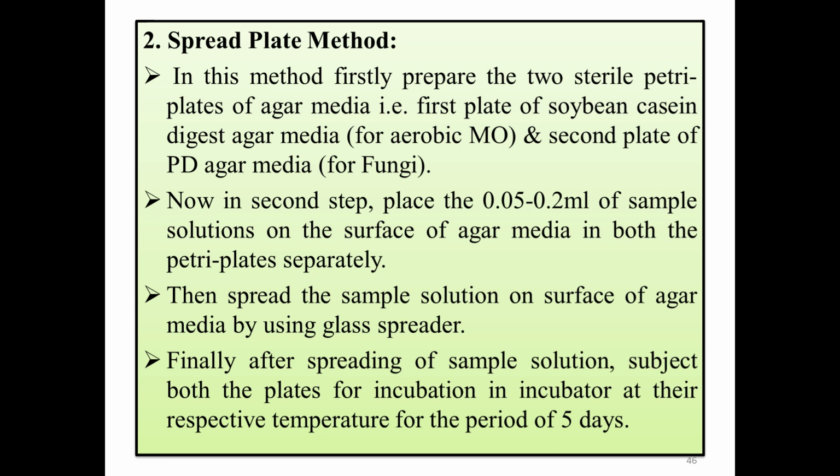With the help of a glass spreader, or anything like a glass slide, which can also be used to spread the sample on the agar media. So we'll use the glass spreader to spread the sample on the surface of the media. Then finally, after spreading the sample, both the plates will be subjected to incubation.